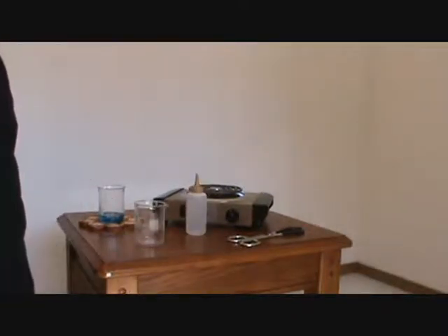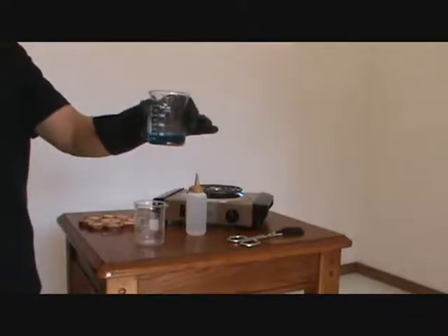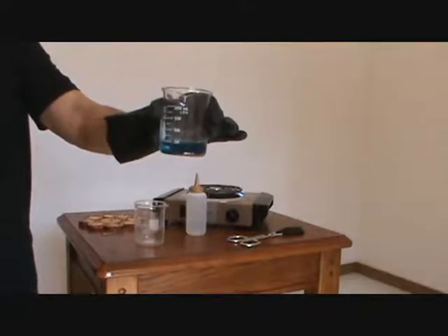Now step 2 is separating the copper precipitate. As you can see, at the bottom of this beaker is a precipitate of copper.